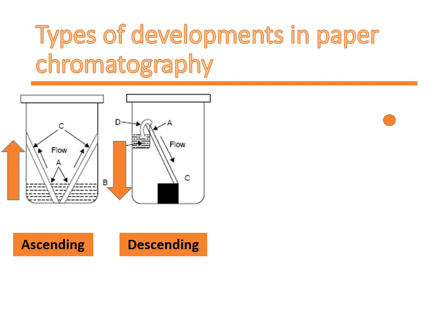Combination of ascending and descending technique is done in the next type of development, where the paper is folded like this and used for the separation purpose.